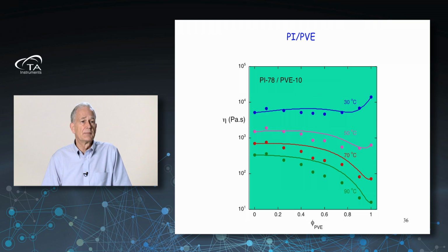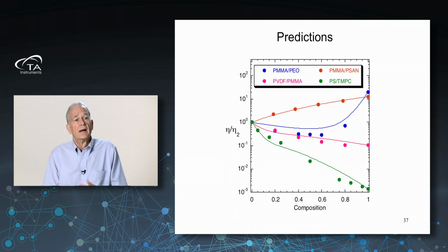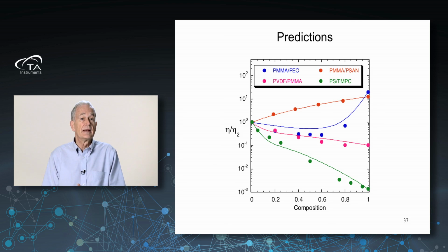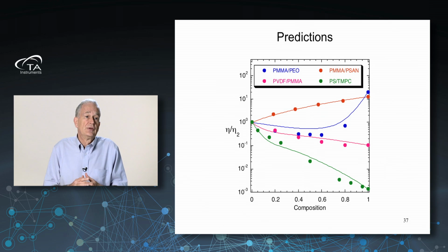That's just a summary of 4 different miscible blends showing all kinds of different nonlinear behavior, either positive or negative deviation from a simple mixing rule. So this summarizes the second part of our miscible blends. In the homogeneous case, if we know the density of the material, and we have the friction term and the plateau modulus, we can do a good job of estimating the molecular weight distribution from simple G' and G" data. You can take that data in half an hour after you've loaded your sample and get a real good idea, especially of any presence of high molecular weight. Then we showed how to modify that approach for heterogeneous blends, and we need to add DSC data to what we would have above, and we would be able to do a good job of modeling that.